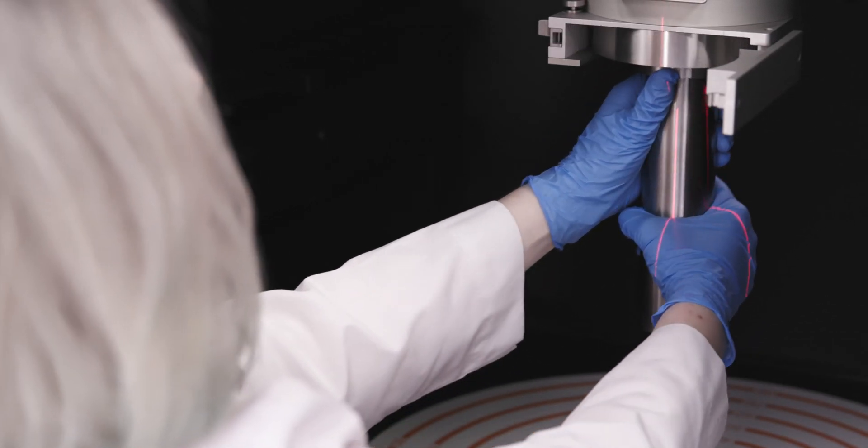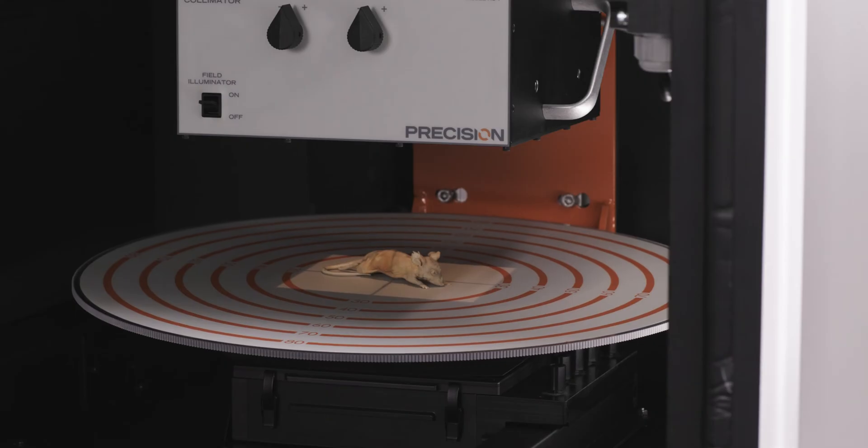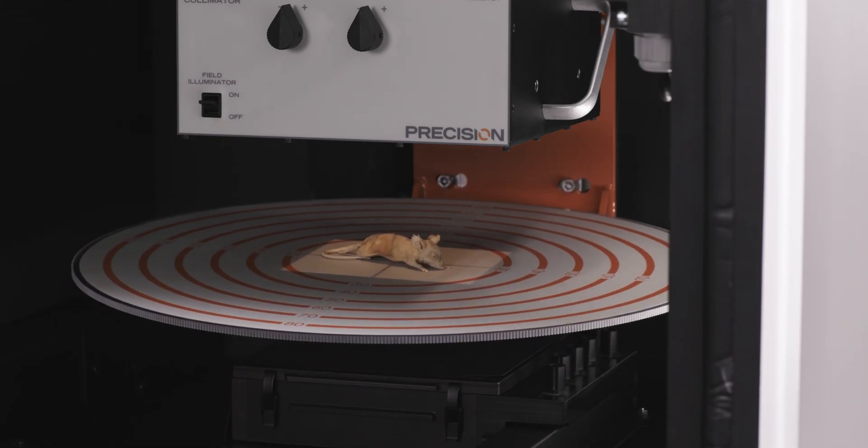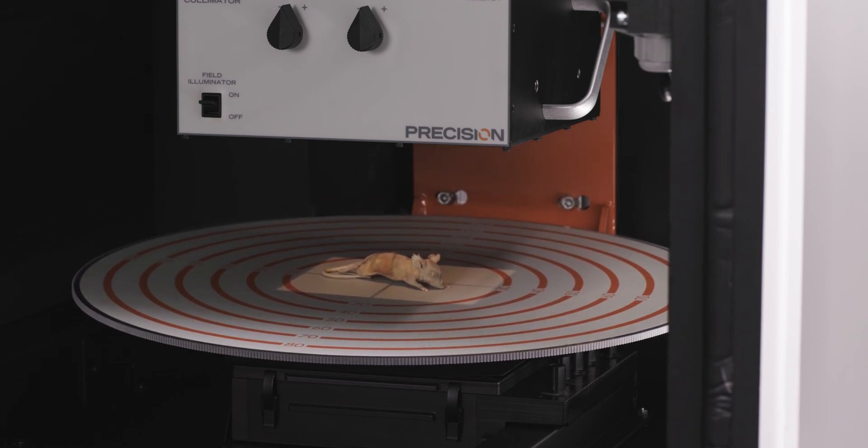Collimation, either fixed or dynamic, allows users to define the exposure field size. This enables targeting through beam narrowing and allows for precise dosing to specific body areas while minimizing radiation dose to healthy tissue.